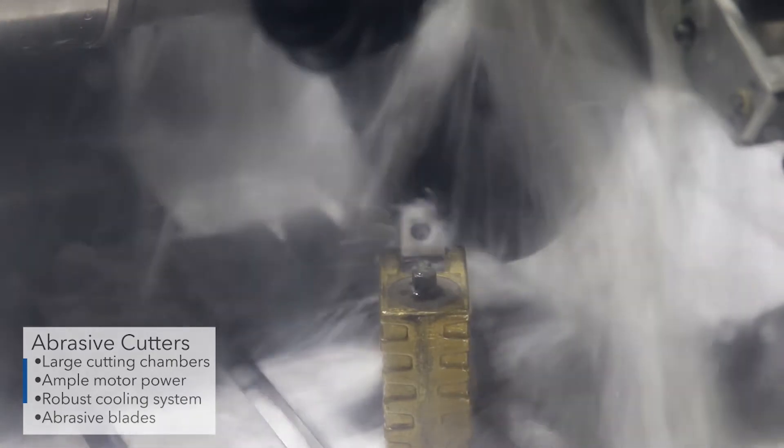These cutters often have large cutting chambers, ample motor power, robust cooling systems, and most importantly, abrasive blades.